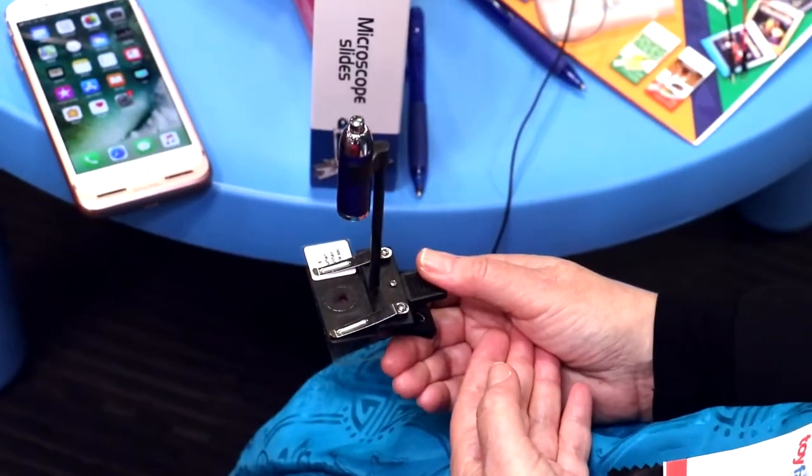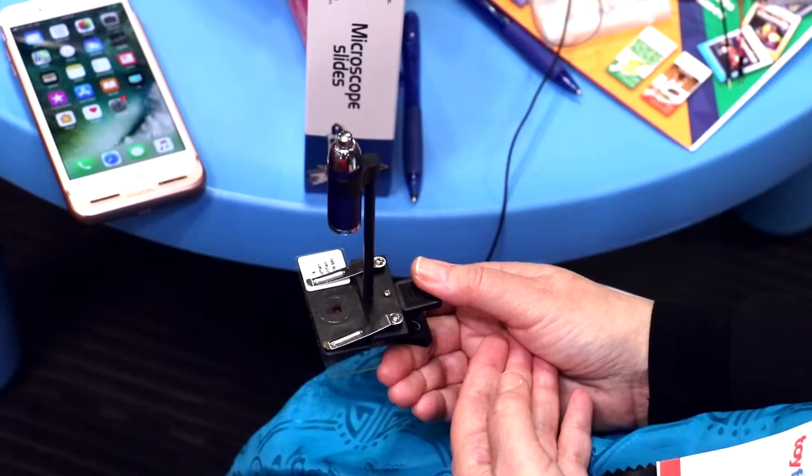What I want to show you today is our clip-on microscope. This is actually a microscope. Now there are clip-ons out there that are magnifiers, but they don't actually allow you to look at slides. And this microscope does. So I want to demonstrate how the clip-on microscope works.